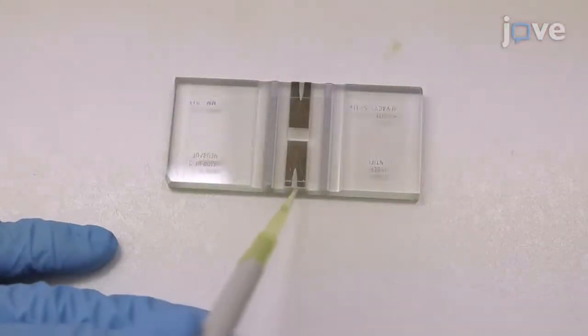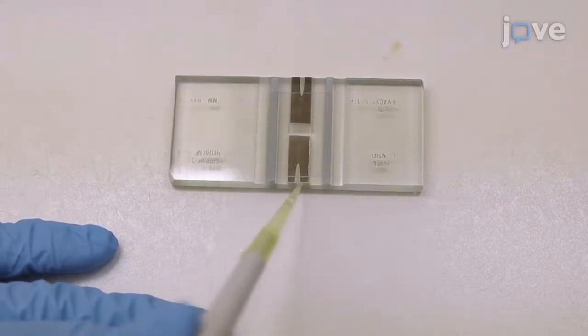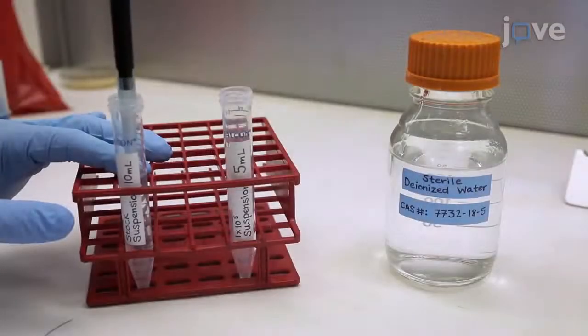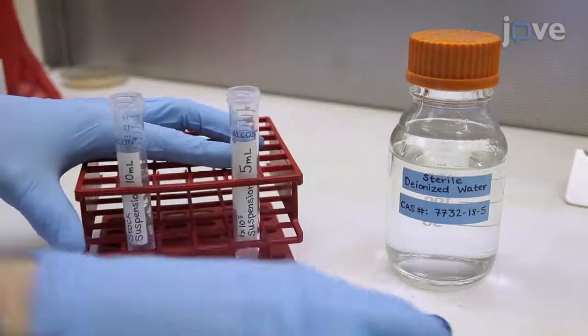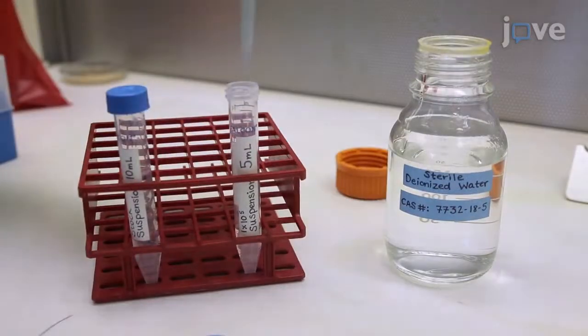Then, place a drop of the vortexed sample onto the hemocytometer and estimate spore concentrations. Adjust the concentration to 0.1 million conidia per milliliter of sterile distilled water with a 5 ml final volume. This is referred to as the spore suspension and is only made immediately prior to use in either bioassay.